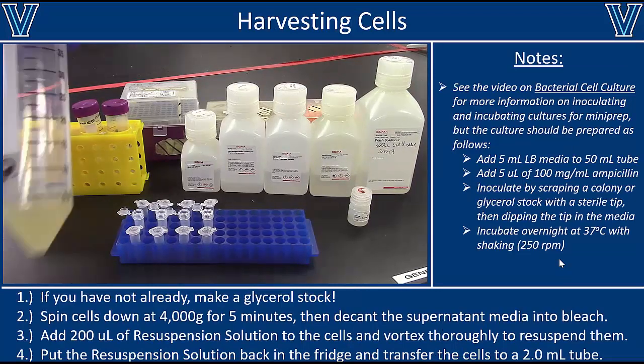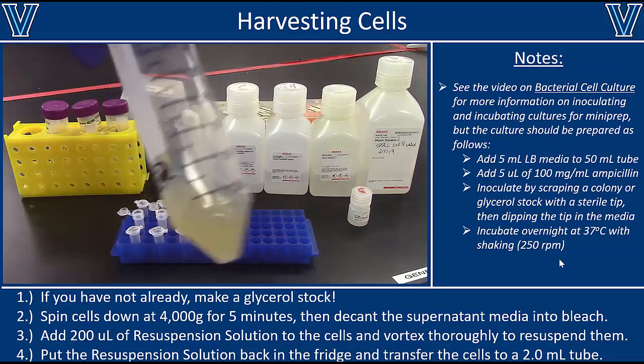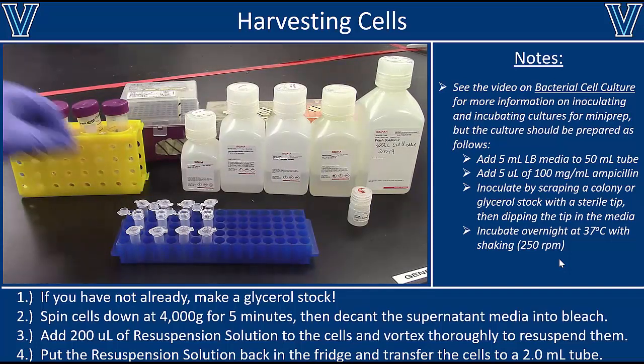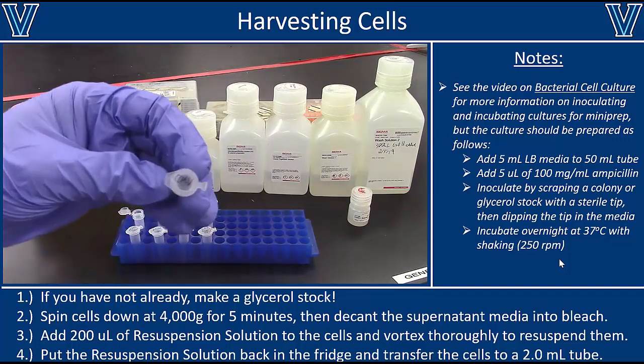The first thing you want to do is make sure you have everything you need. So here's an example of a bacterial cell culture sample. Notice that it's highly turbid. If it's not turbid, then put it back in the incubator.